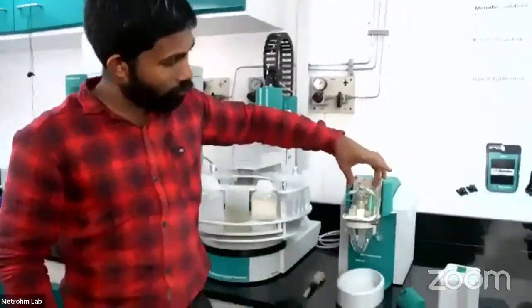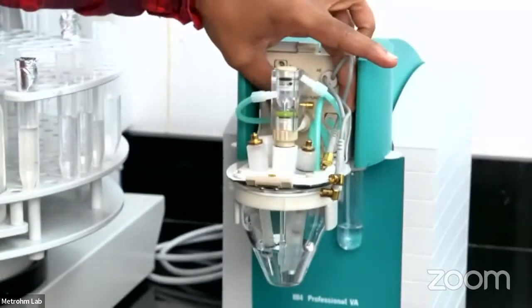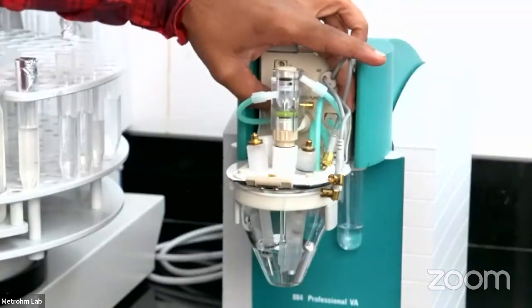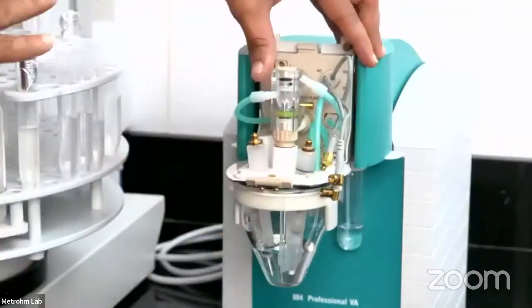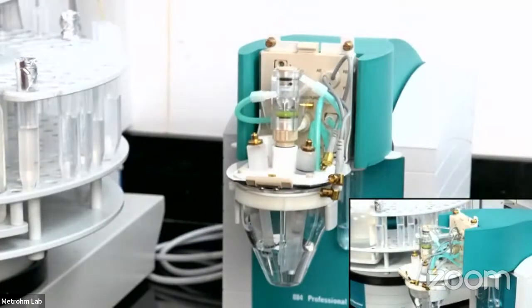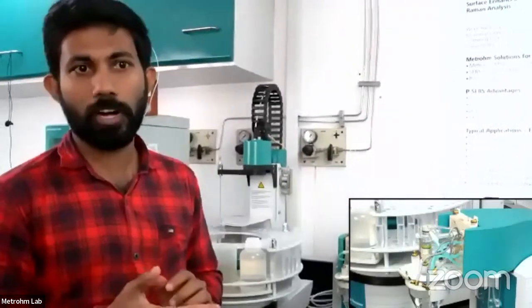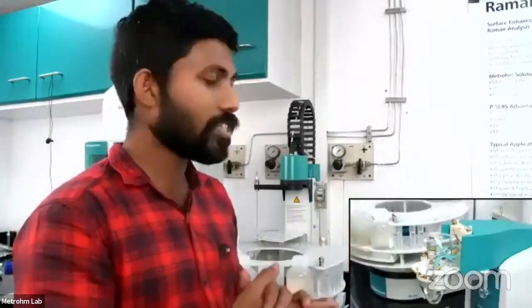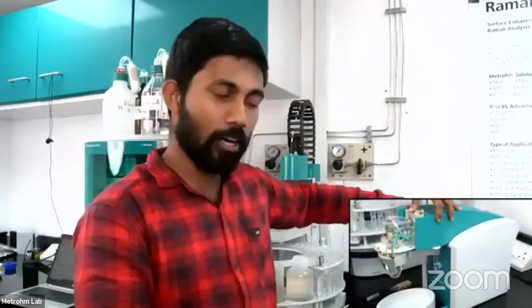And basically, we have some options like nitrogen purging. Whenever you are taking a sample, the sample will be purged with nitrogen initially to remove the oxygen content present in the sample, and will be flushed throughout. And it will be completely performed in a closed vessel system. And we can perform the analysis as Narendra sir has told already, like zinc, cadmium, lead, copper, nickel, cobalt, arsenic. And most importantly, irrespective of just simply metal, we can also determine the speciation or oxidation state of different metals by using the same system itself. So this is the outlook of the VA instrument and how it looks like.